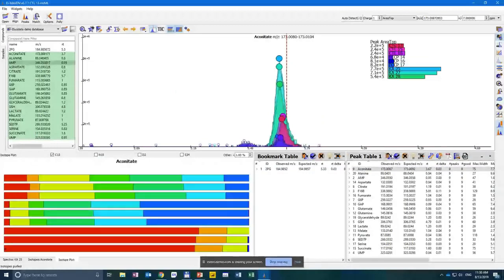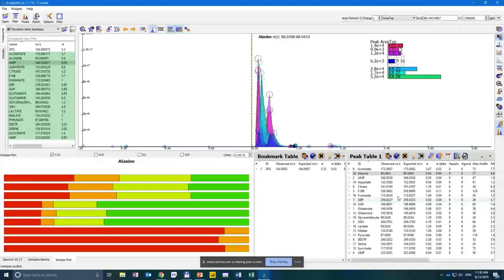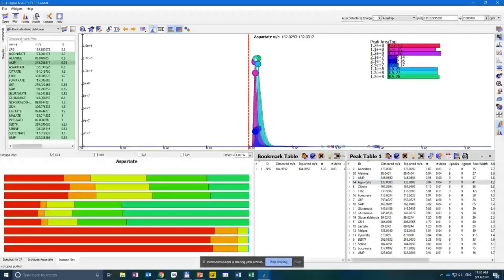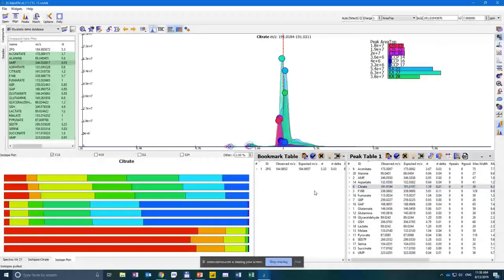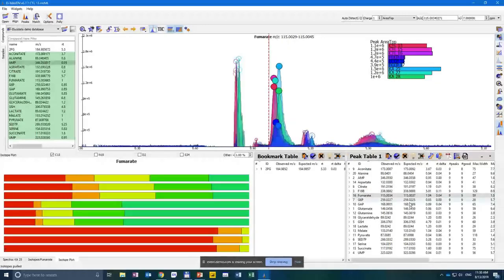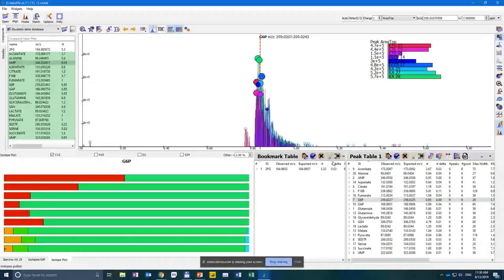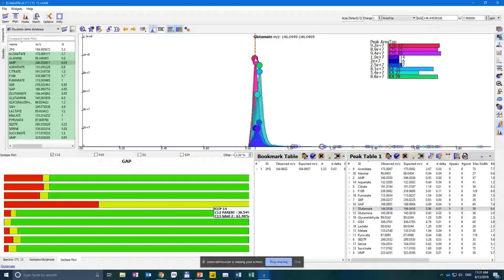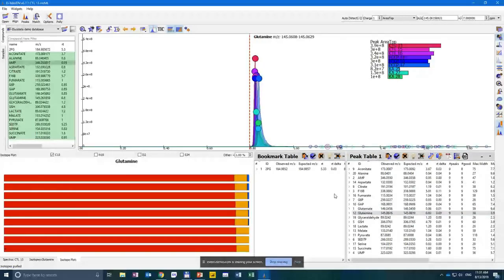I'm going to quickly check all of my assignments in the peak table just to make sure that they were picked properly. And as you can see, it found most of the peaks, and just clicking on each one of them, you see that there's a very specific isotope pattern in each group. This visual representation helps a lot just by going through data and making sure that all the assignments have been performed properly. This really doesn't take a long time, but is very helpful. We can quickly learn about some issues that may arise, and we can also correct misassignments on the fly.